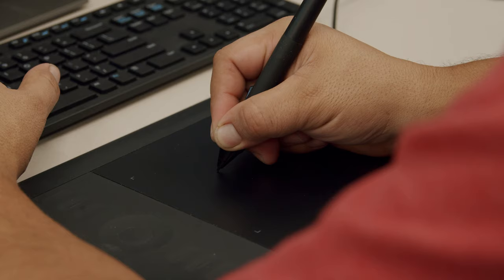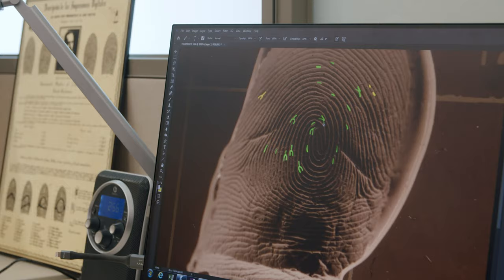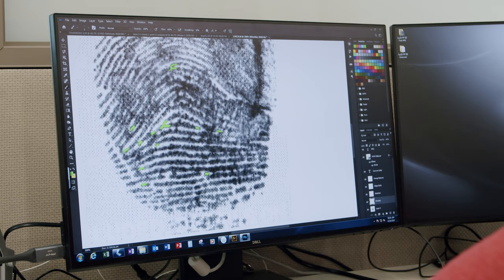Mainly what I would do would be to screen the latent prints with my magnifying glass. Today in this age, we have some great tools, such as a software called Photoshop. And then we have the tools such as the scanner and a computer. So you can mark several features and use what we call target groups. Something that we can recognize and memorize in the latent print, so that when we go and look at the known print record, we're looking for those same features to see if we can find similarities.